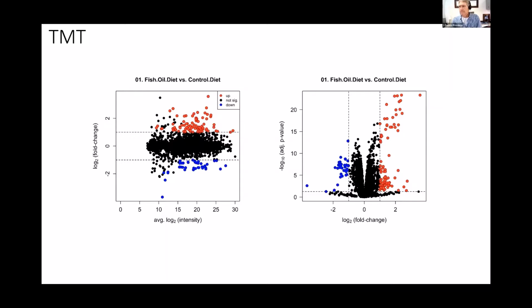The one that you'll be able to tell a big difference is if VSN is performing better. RLR has actually performed better on some of the data sets as well, but I'm not as familiar with that one, but it has given me some better metrics. And the metrics I'm looking at are those in ProteoNorm: you want the variance of those box plots to be the lowest and the correlation to be the highest. And the log2 ratio is the one that really helps narrow between multiple ones, because you can really see the shift in the distribution. And you want that distribution to be centered at 0.